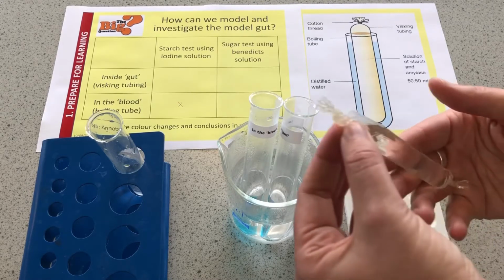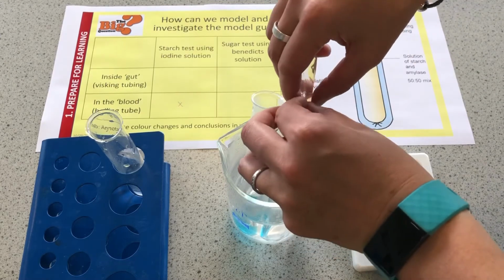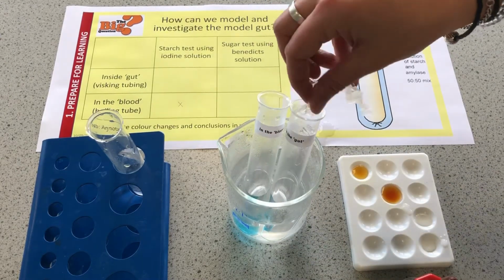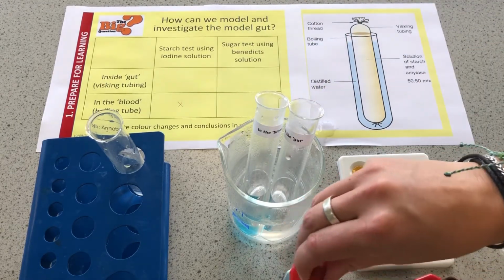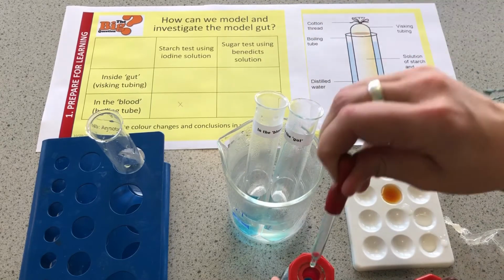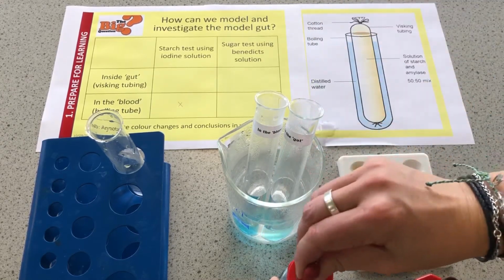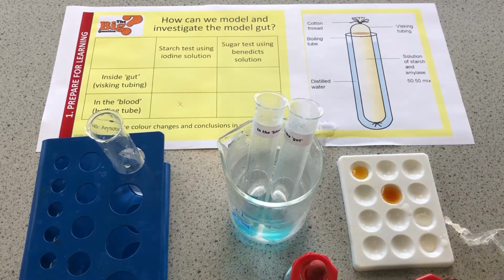Now the rest of the contents of the small intestine, I'm going to put into this tube. There we go. And I'm going to add some Benedict's to that, and that's going to see if there's still sugar left in the gut. And again, I'm going to leave this for a time and come back to you with the results.